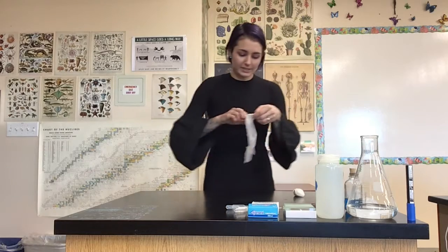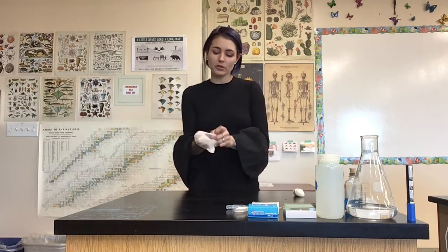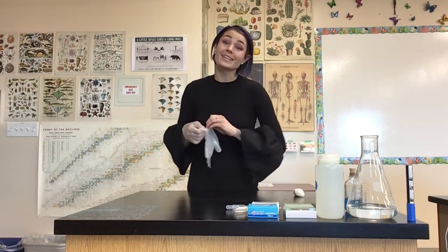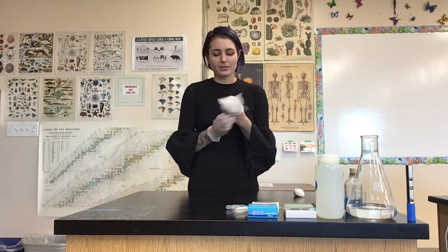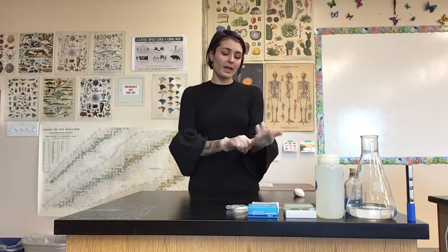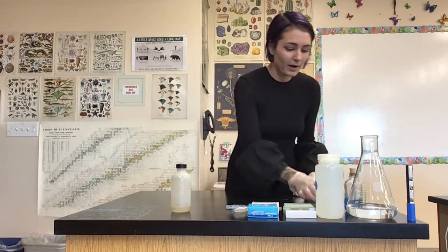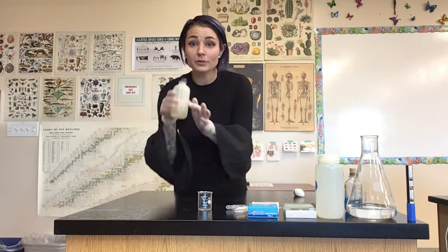So the first thing I need to do is put on some gloves because we're going to be working with hydrogen chloride, which is an acid that can hurt your hands or your skin if it gets on your skin. So we've got to make sure that we are being safe. Now, I'm only going to use a few drops of it, but even still, I've got to make sure that I'm following safety protocols.